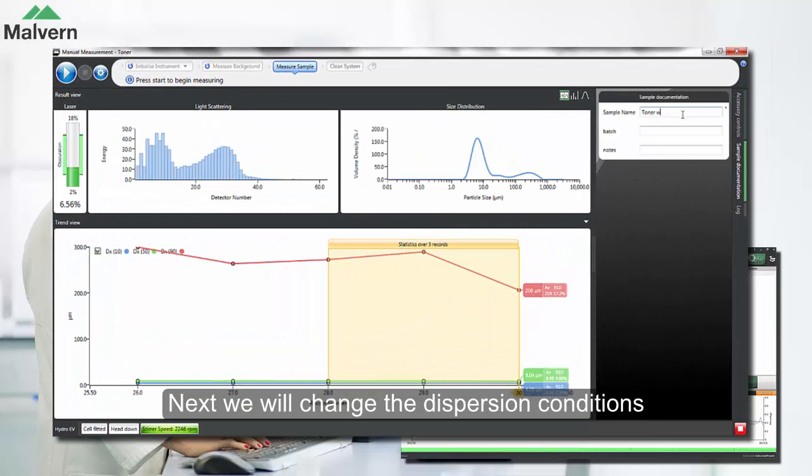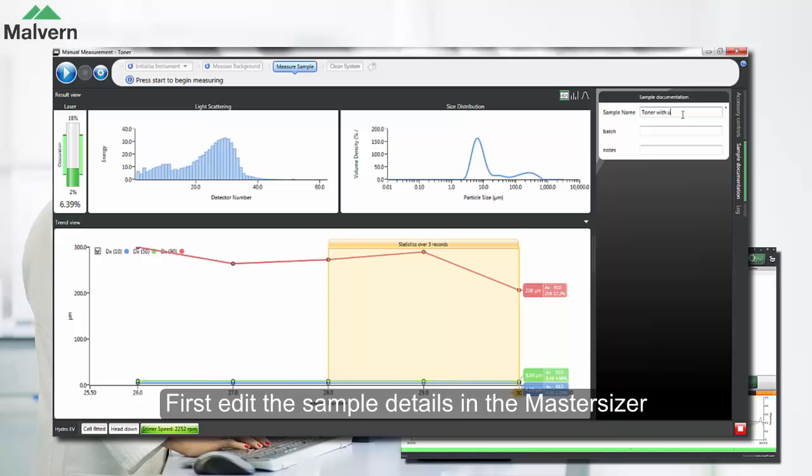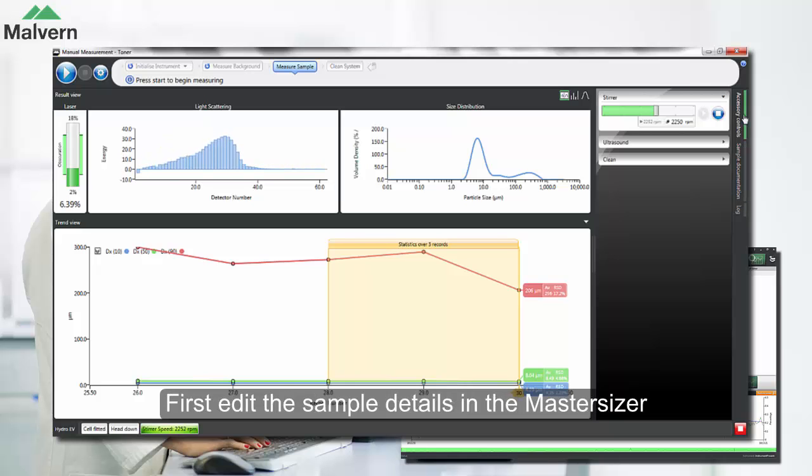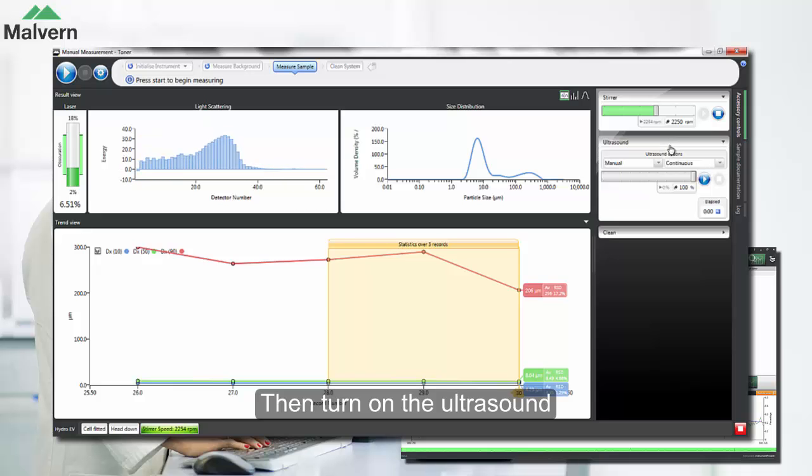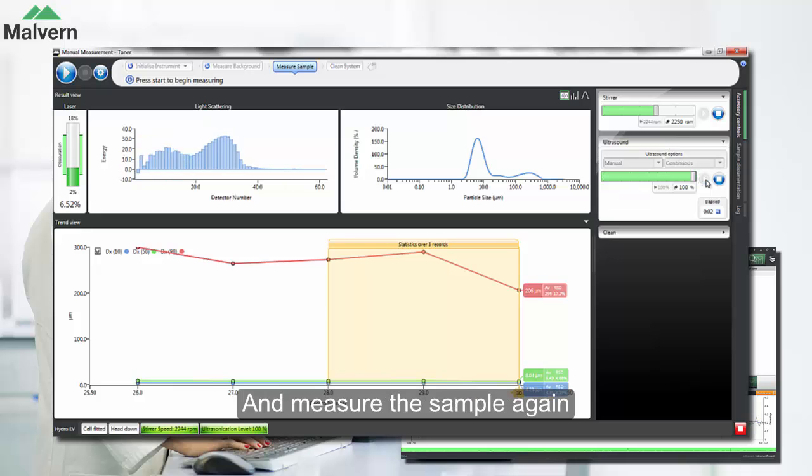Next we'll change the dispersion conditions. We'll edit the sample details in the MasterSizer to show that we're going to apply ultrasound, and then we'll turn on the ultrasound and start measuring the sample again.